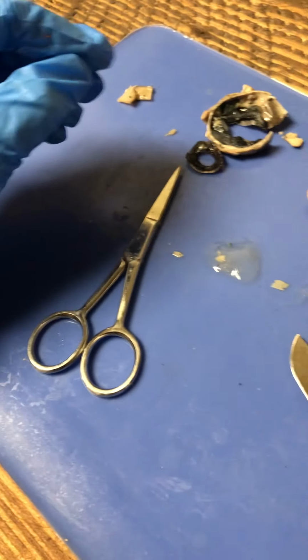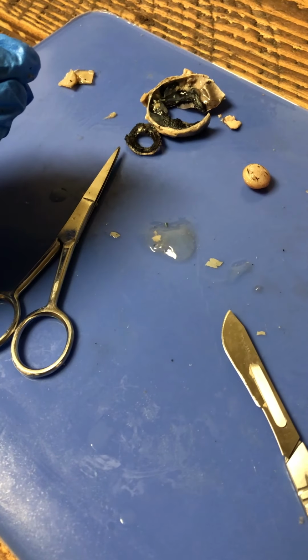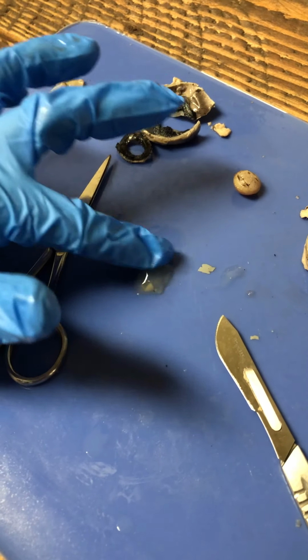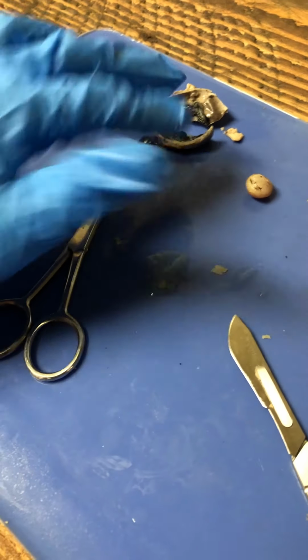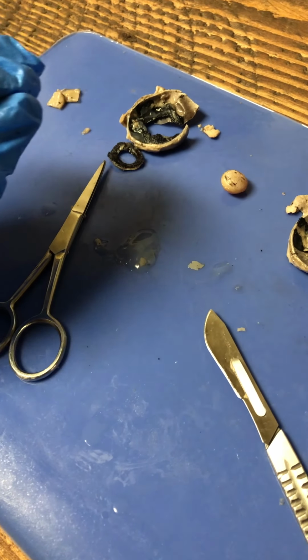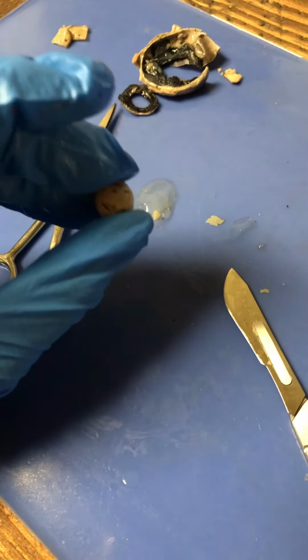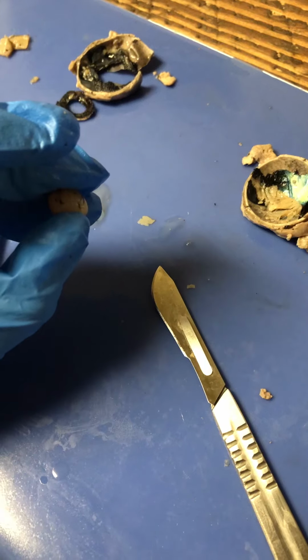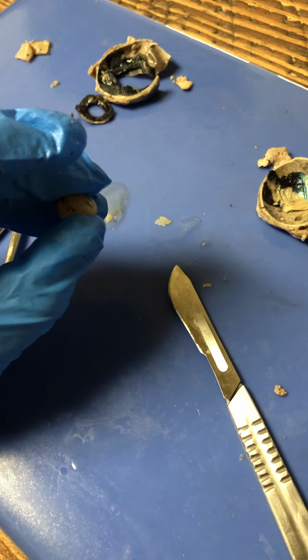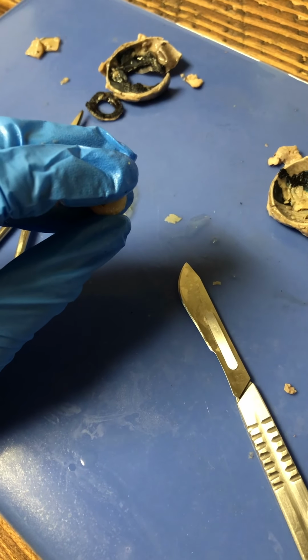And then we have the aqueous humor, that's a clear fluid filling between the lens and the cornea. Well, mine fell out and it's this stuff right here. There's a little bit left in here, but not much. It's all right there, basically. And then we have the lens, which is a really hard circular object. It's a biconvex structure that focuses the light that comes in through the cornea and the pupil.